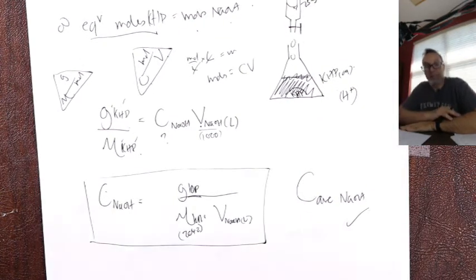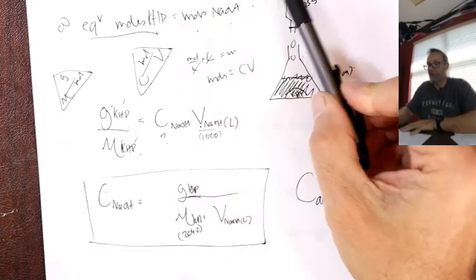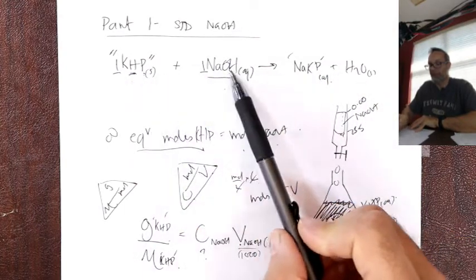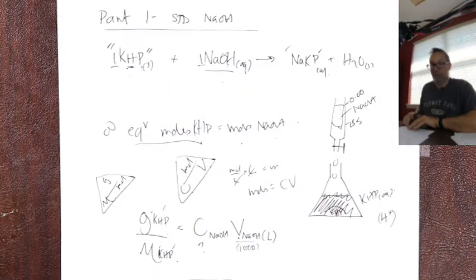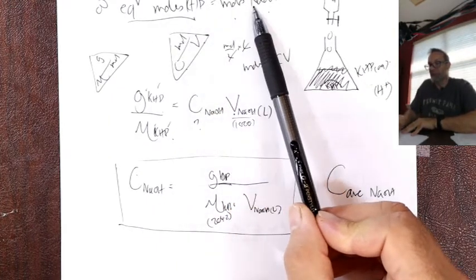I will put a link to a video with titration so you can actually see this in practice. I advise you to watch it. But very simply, just to recap, acid plus base makes salt plus water. When these are in equal amounts, we see a color change. So we combine them until the color change happens. At that point, moles acid equals moles base.